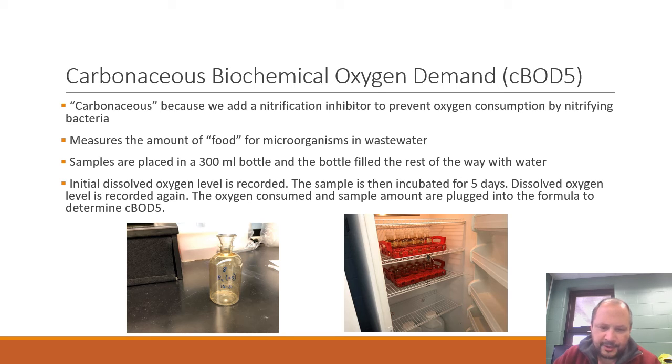Biochemical oxygen demand, this is a test that we use to estimate how much food is available for the microorganisms in our wastewater. We've touched on this test before, and did the math. Basically, what we're doing is putting our sample in a 300 milliliter bottle. That's the standard bottle size.